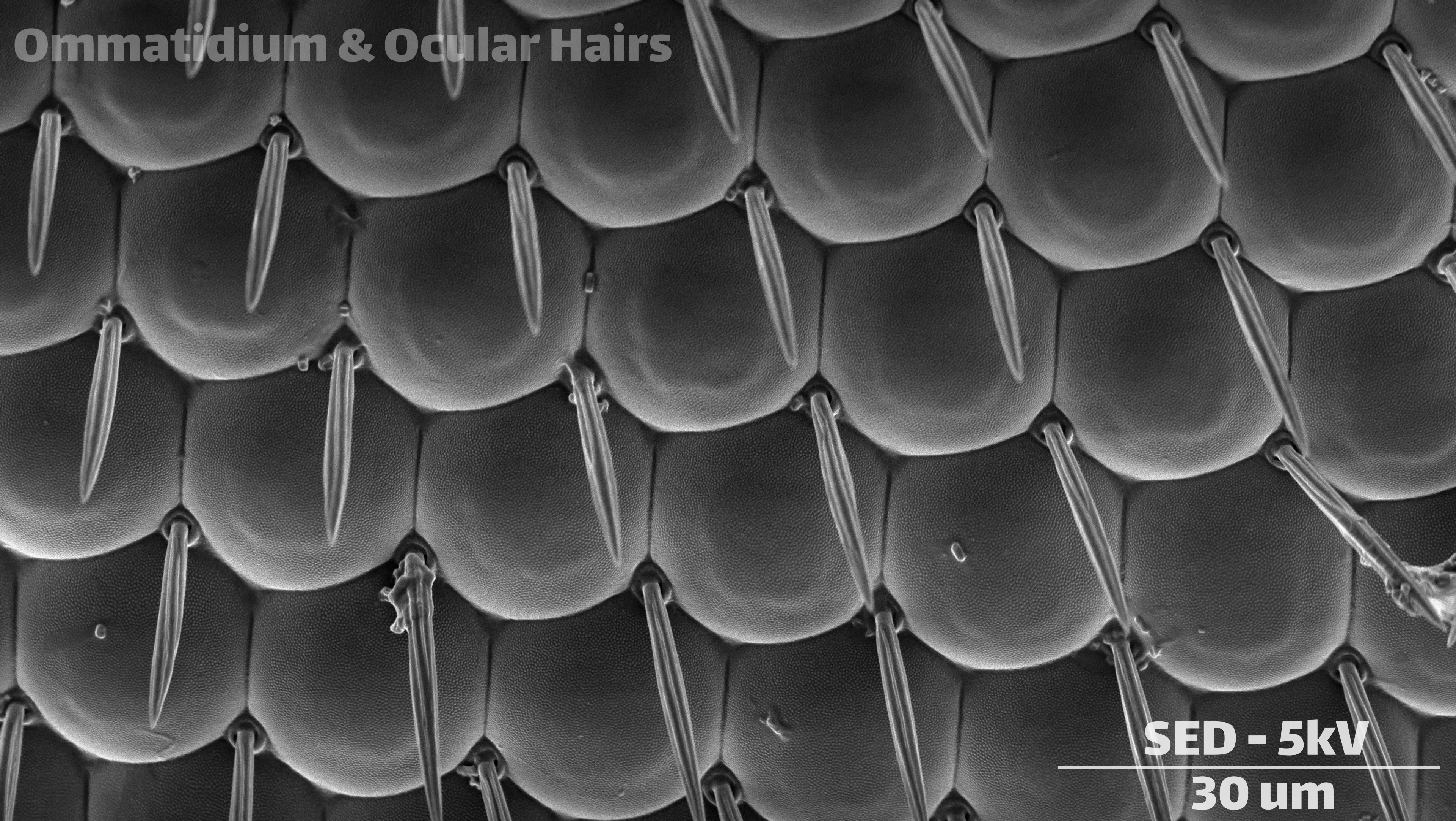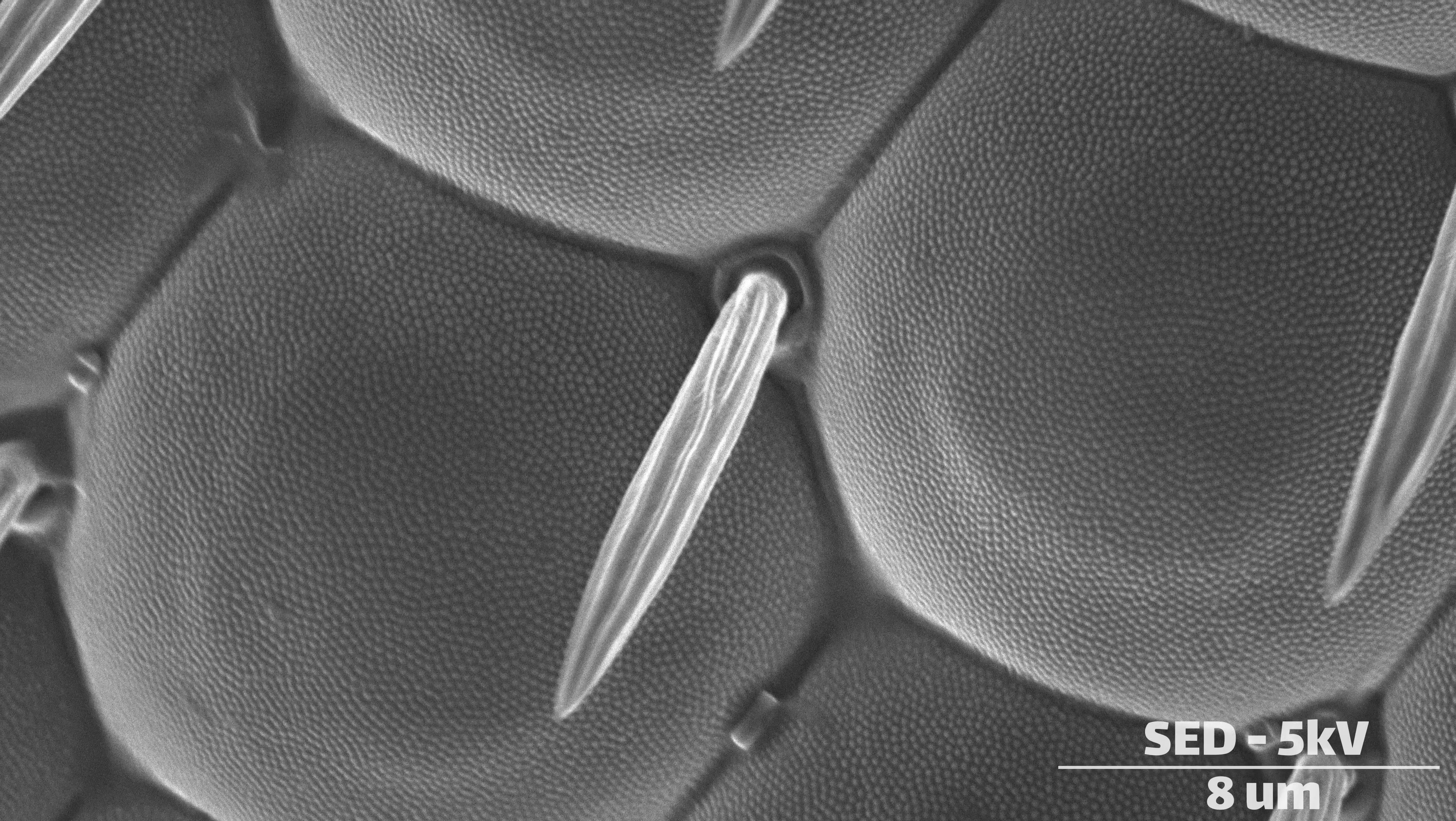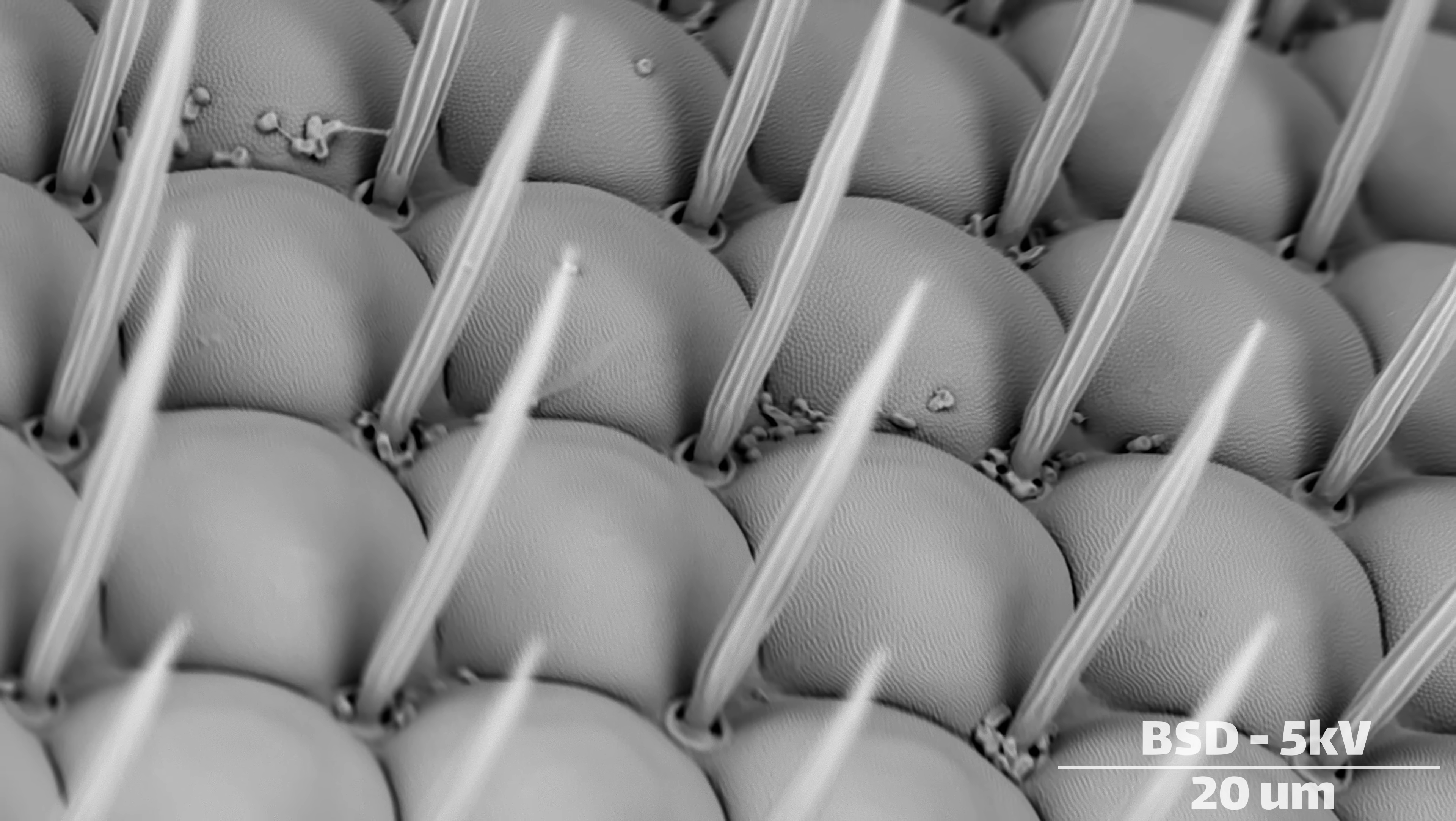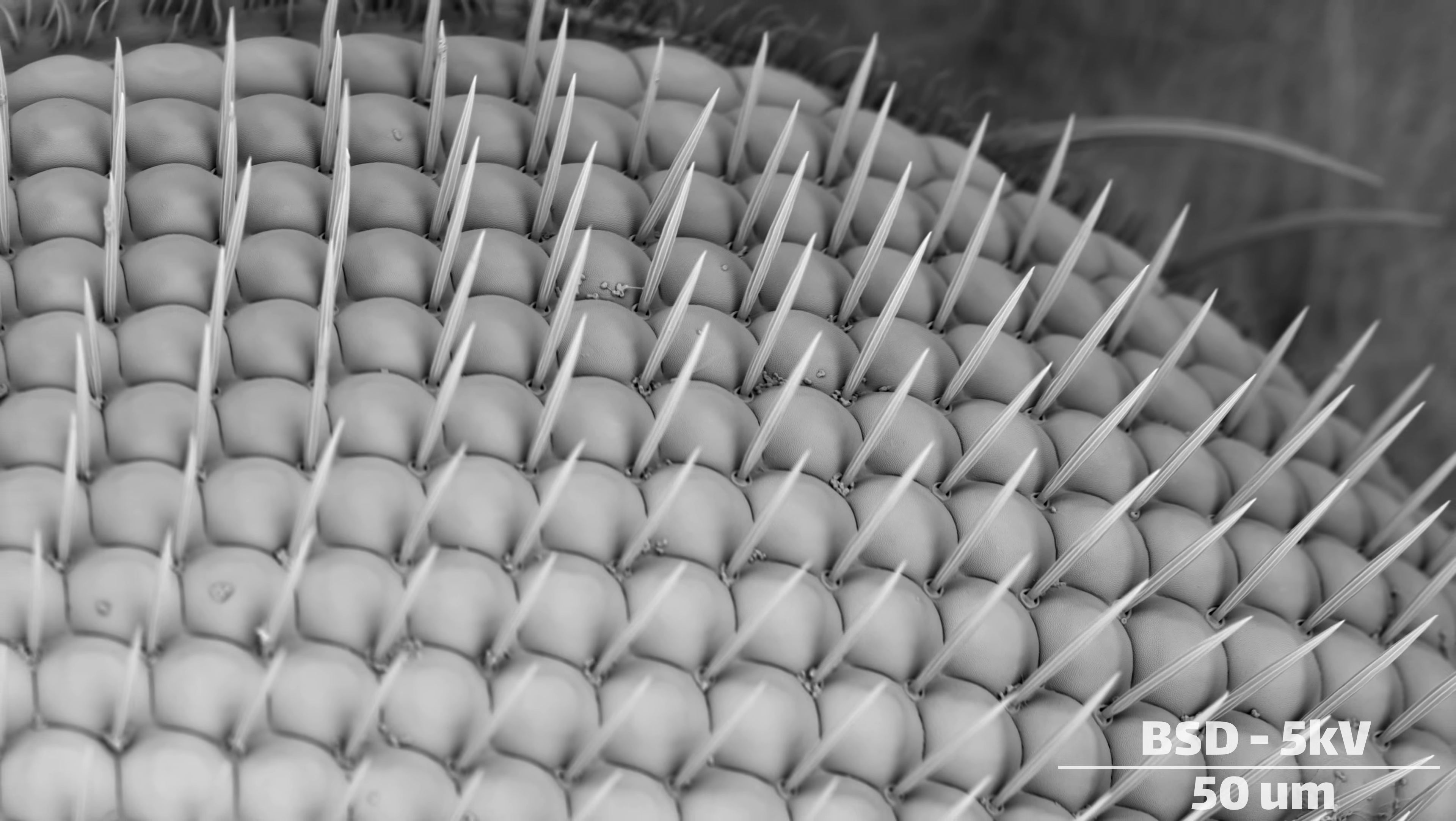In between each segment is an ocular hair. It's believed that these operate similar to mammalian eyelashes. They deflect air currents and create a pocket of stagnant air just above the surface of the eye, which helps prevent dust and particles from getting stuck. When half your body is literally an eyeball, it's important to keep them clean.